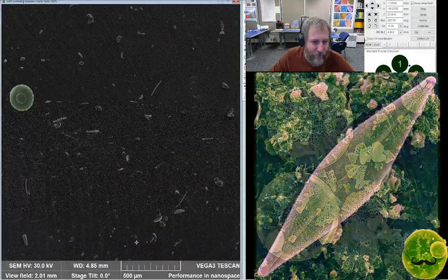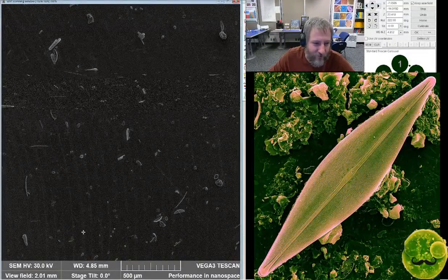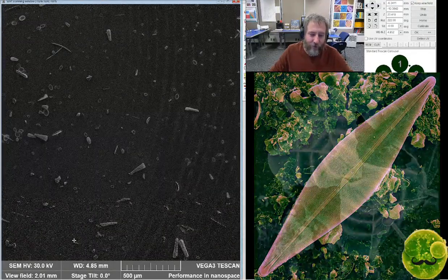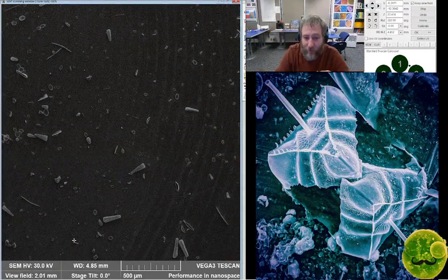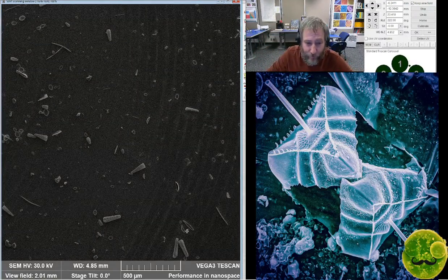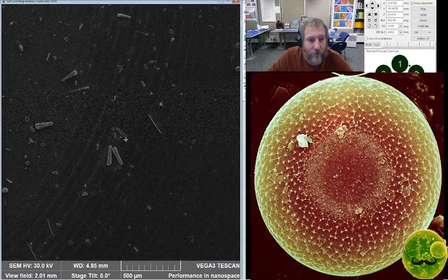But that's the general model for it, as I understand it, a simplified version of what's going on. But they produce different things. And then there's also a transmission electron microscope, which is basically like the scanning electron microscope, except rather than getting a topographic response, it's more like a transmitted light microscope, where the electrons go all the way through the object and then the sensor's on the opposite side, like a typical upright light microscope has.